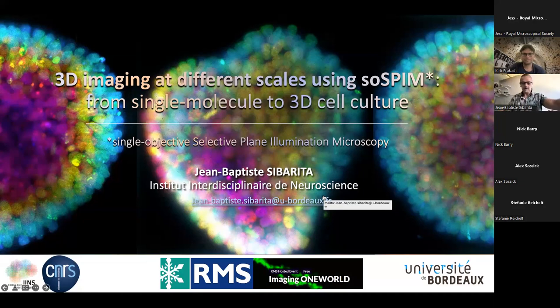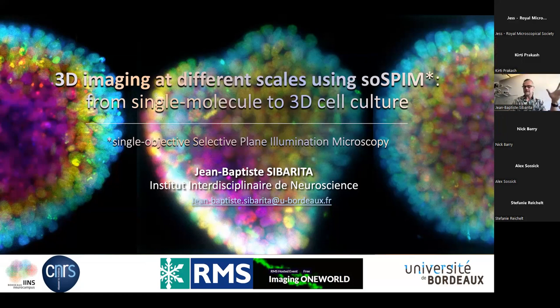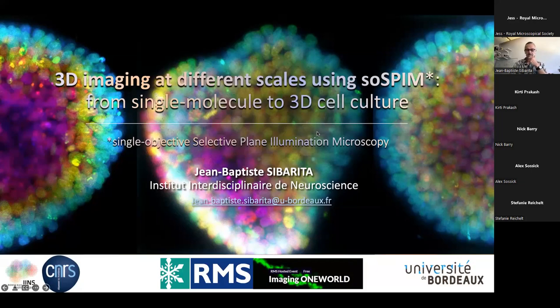Thanks very much for giving me the opportunity to talk today and present what we are doing in my group in Bordeaux at the Interdisciplinary Institute for Neuroscience, where I have been for a bit more than 10 years now. Today we'll talk about our ongoing work trying to bridge the dimensions between the single cell, the nanoscopic level, up to something pretty new in our hands, because we spent many years doing super resolution, which means isolated cells, to get the best of what we can do at the single molecule level.